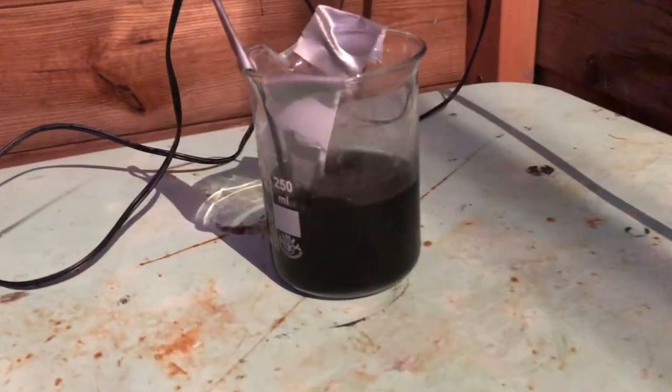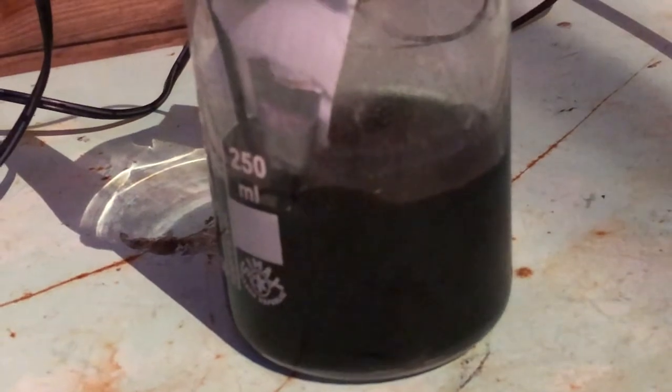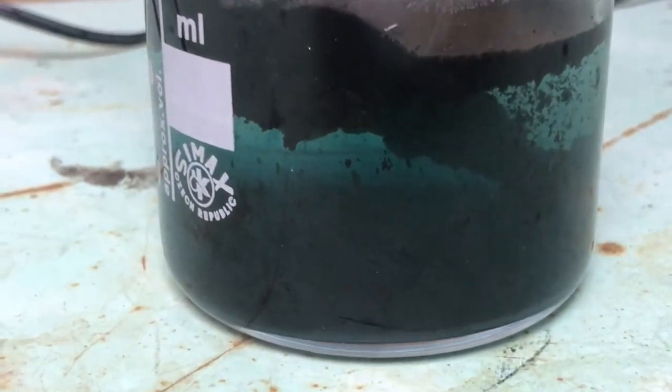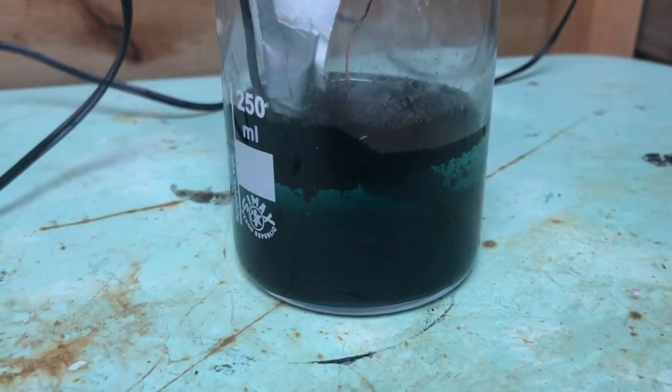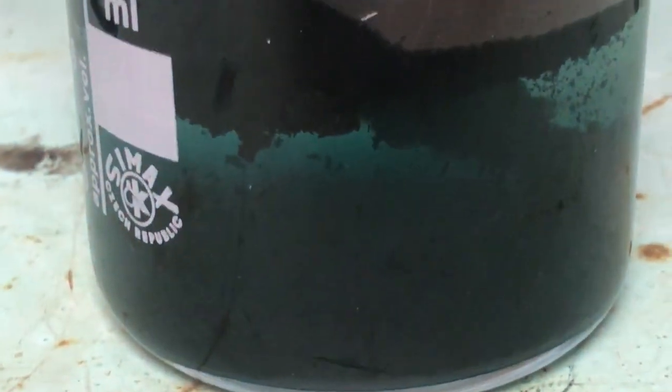A few hours later, as you can see, a lot of graphite powder has turned the solution black. The electrodes are completely gone and there's still some blue left, so I'm going to filter this and run it again until there's pretty much no blue left.